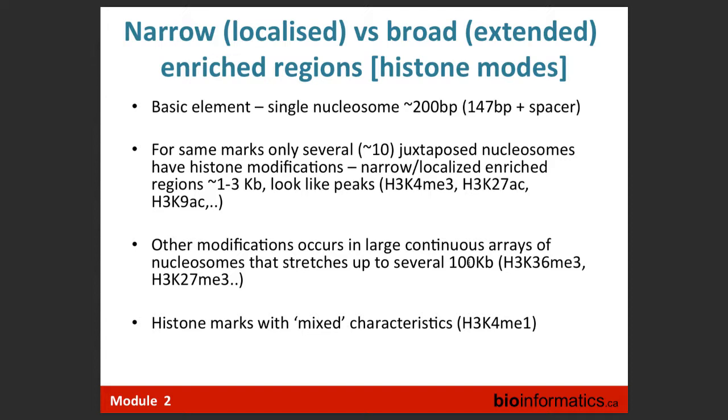Yes, I don't know if that's what we're going to talk about in the next few minutes. You mentioned that we cannot just subtract the input because the reads could be different. If I look at the ChIP-seq data and just look at the peak, I always go down and check all the marks and look if there's a peak as well. So I always imagine that's okay, right?